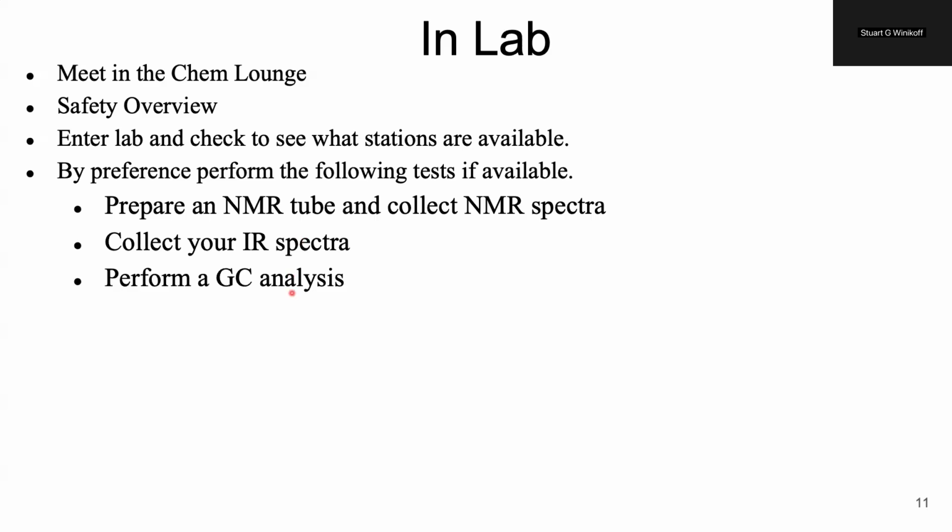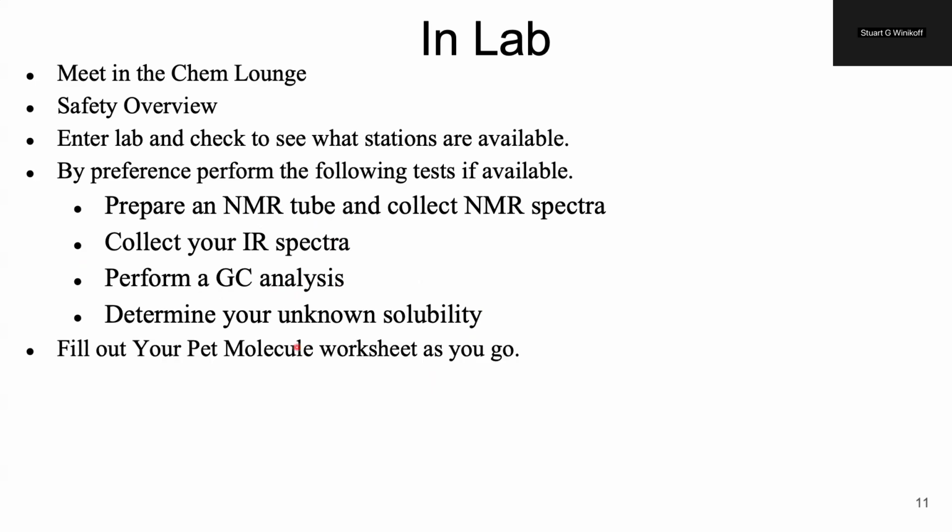Then make sure to perform the GC analysis. After you've received instruction, you can do this on your own, and determine your unknown solubility. This one you can run entirely on your own, and if you need to, you can leave it off in the middle if you have a chance to run the other ones. And again, because we're working with larger classes, I'll try to push you through these as fast as I can.